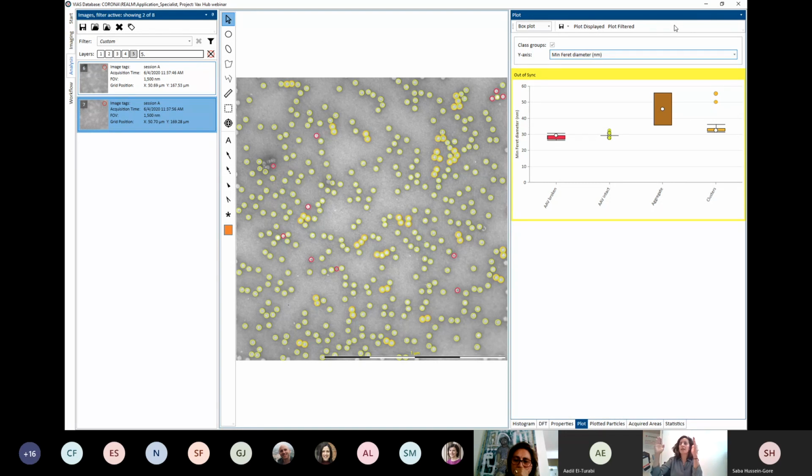But I think it's quite a fun thing, because sometimes we can see a slight variation in the size distribution of some of these particles that we often perceive to have a very uniform size. It's maybe quite difficult to pick up when you're looking at 1 or 2 particles, but when you're looking at 40,000 or 50,000 particles, you could potentially pull that apart and look at it further.